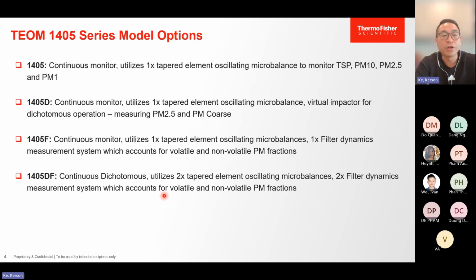Okay, so as you can see, 4 models, 1405. Okay, is the direct measurement by TEOM, and we can monitor total suspended particulate matter, and PM 10, PM 2.5, also PM 1.